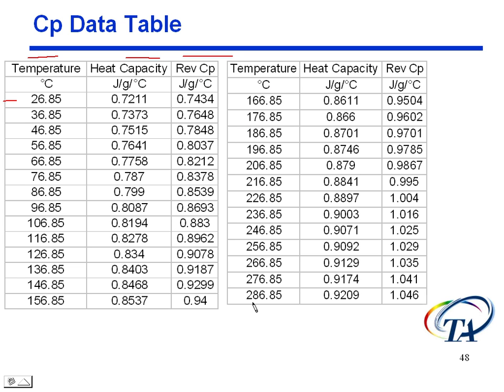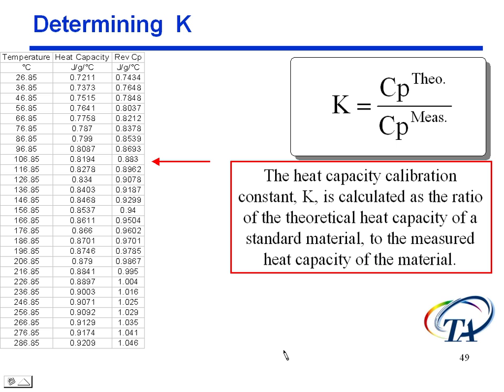Now that looks like it's kind of a weird temperature. Why would you pick that? You'll see in just one second here. Now this is that table again.